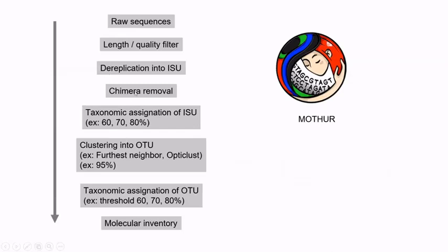And then, I don't know if you remember, sometimes you can have some chimeras. Chimeras are when you start sequencing one species, and then in the PCR there is a problem and you continue with a second species. So chimeras are like a lion or an elephant. All this is not reality. So you have to remove these chimeras, and then you make a taxonomic assignation of these species.